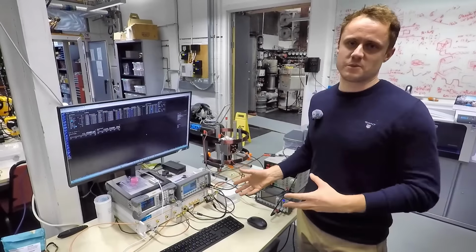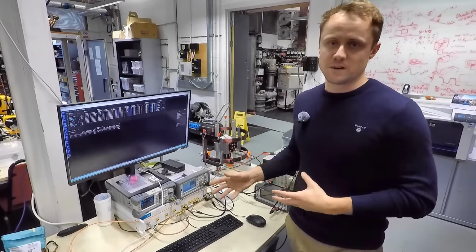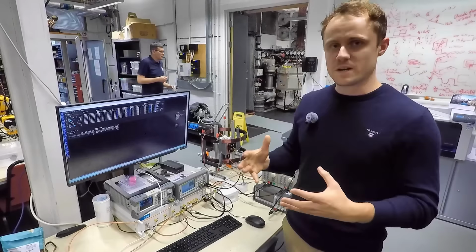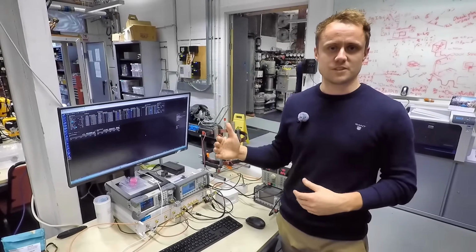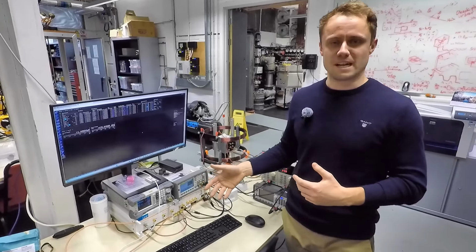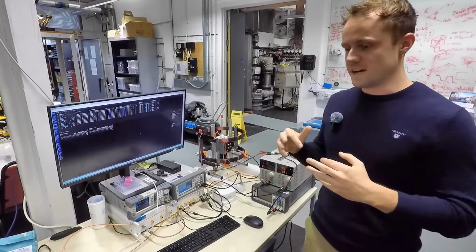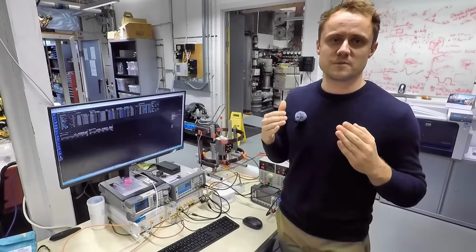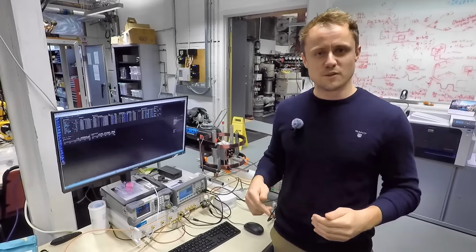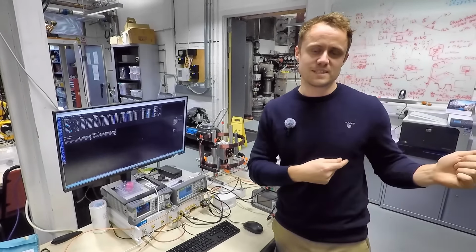And so that is one of the reasons we do modulated measurements like this, is that lock-in amplifiers can measure signals at specific frequencies where the noise at other frequencies can be orders of magnitude larger than the signal of interest. And the clever electronics in a lock-in amplifier allows you to reject all that other noise and only pick out the signal of interest. So that's why a lot of measurements like this will end up using some sort of modulation. So what does the signal look like when you do a measurement like that? Well, we'll cut to a whiteboard and I can talk you through it there.